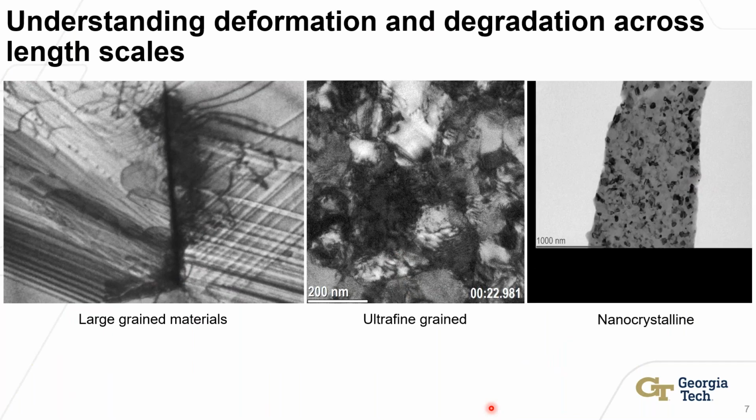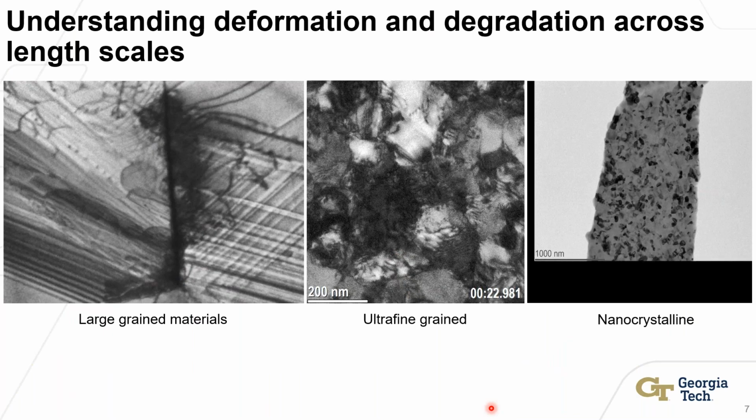We're not able to really see the dislocation flow, the dislocation interactions, but we do see the evolution of the grain boundary or the grain state itself. And that movement through different length scales has really motivated the development and search of different tools where we can really quantify the microstructure, right? We can no longer rely just on observing the deformation mechanisms.